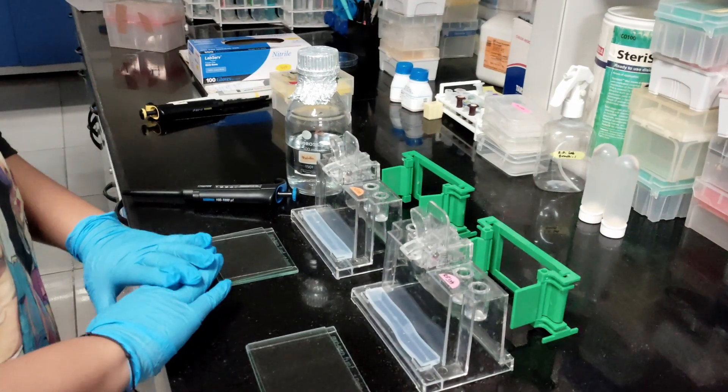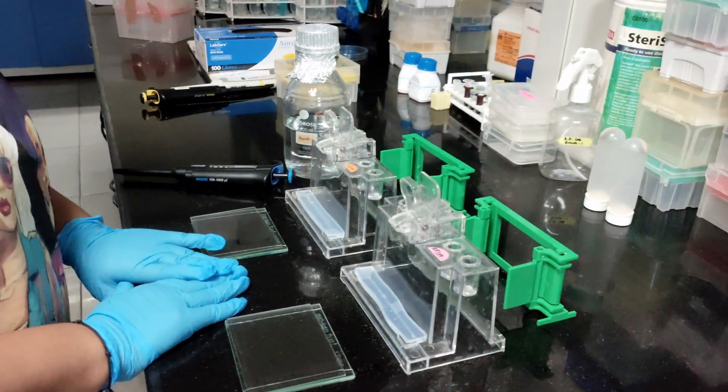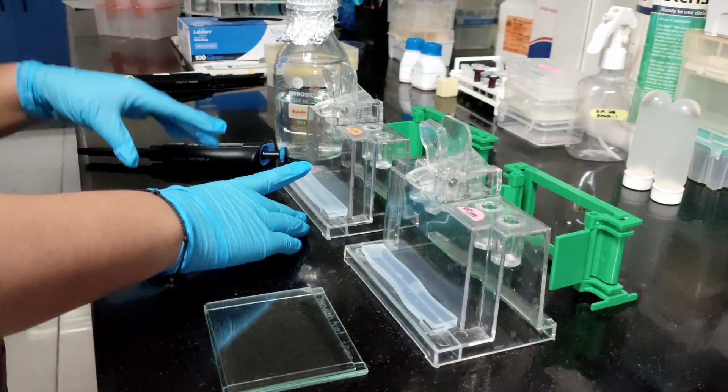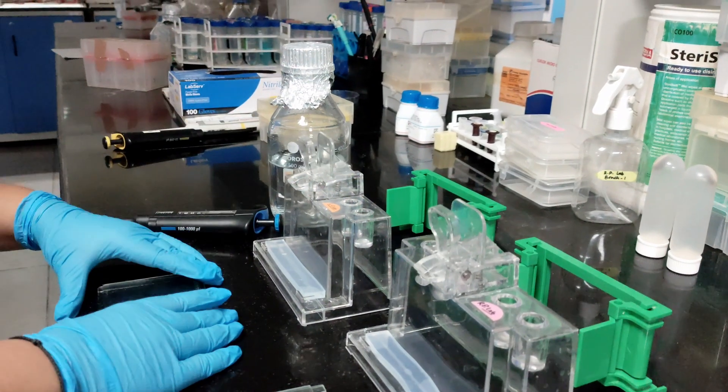Good morning everyone. Today I'm going to teach you how to make SDS-PAGE gels. First, we are going to set up the plates. Before making any SDS-PAGE, this equipment is known as the SDS-PAGE caster.